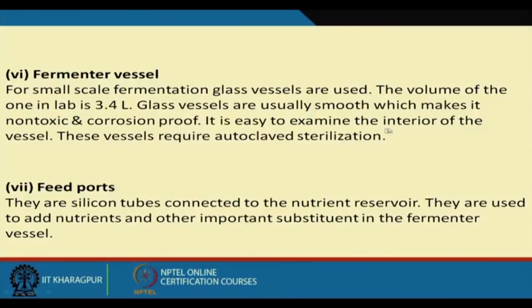We discussed before how the composition of the alloy steel, stainless steel, improves the acid resistance or corrosion resistance of the stainless steel. That is why stainless steel is used in the fermentation industry.